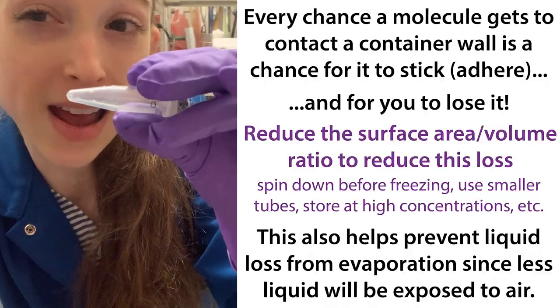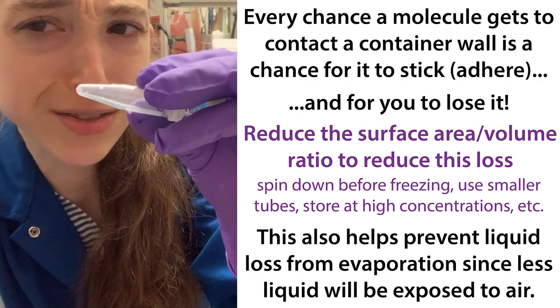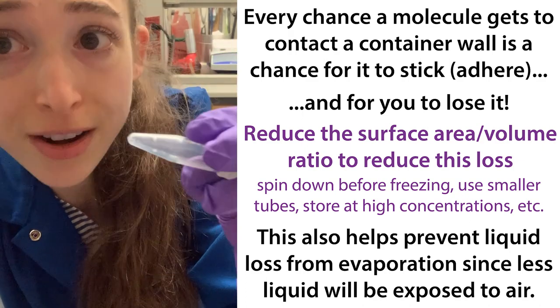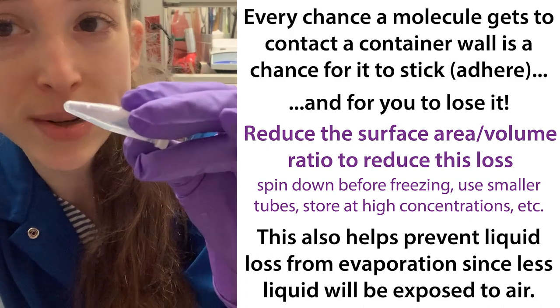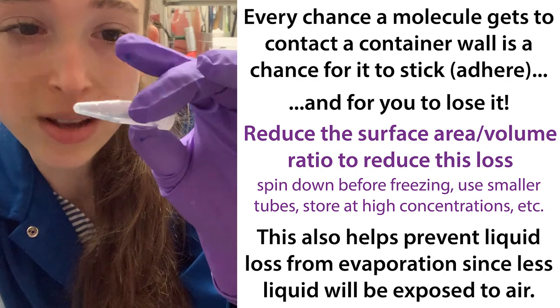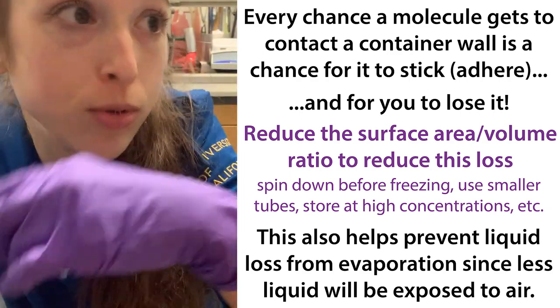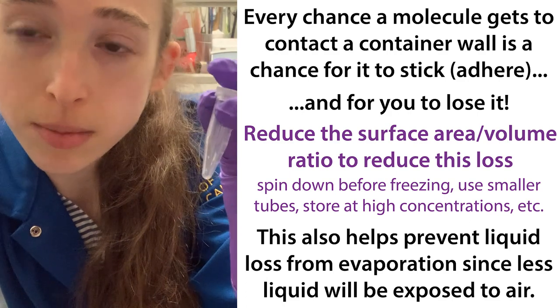This is not only going to have more molecules stick to the tube, which can decrease your concentration, but it can also increase your concentration because you're going to have more exposed to the air, which can evaporate — so basically your concentration is going to be unreliable. Also, if you have liquid on the cap, when you open that cap, things can spray out and you can lose some of your sample.